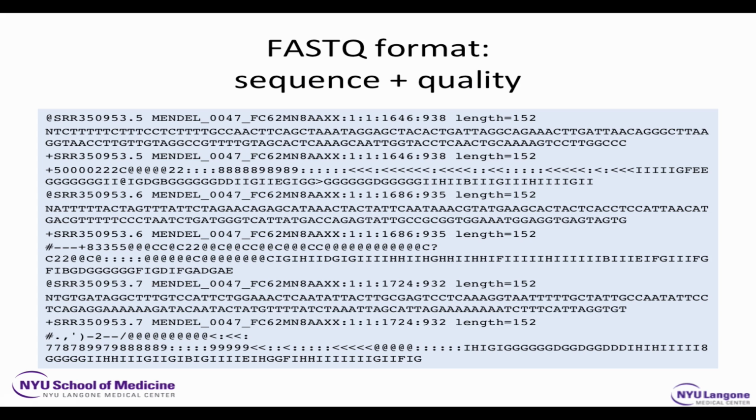All right, this is the data file in what we call FASTQ format. You'll notice that it is somewhat human readable in that it has letters. There are 4 lines in the file for each read that is produced from the sequencer, which typically corresponds to each molecule in your library, which attached to a spot on the sequencing plate and generated good quality fluorescence data.